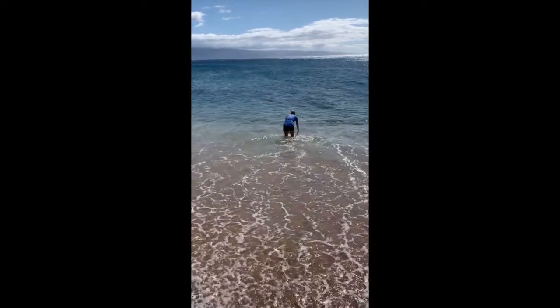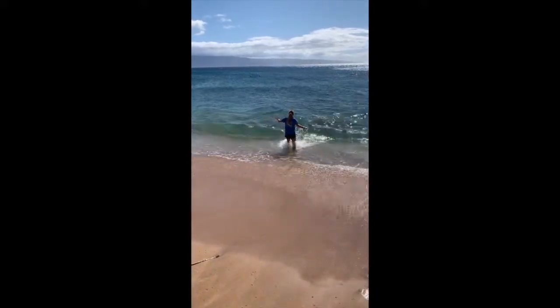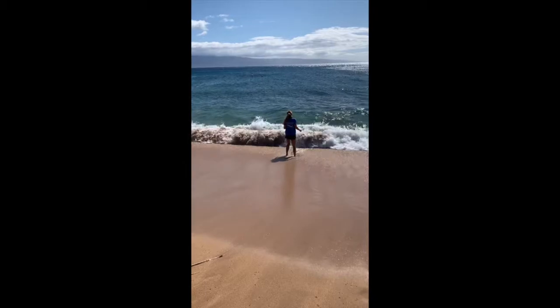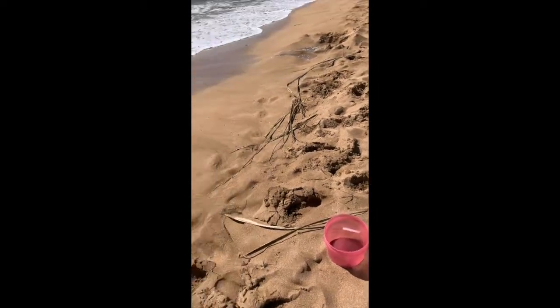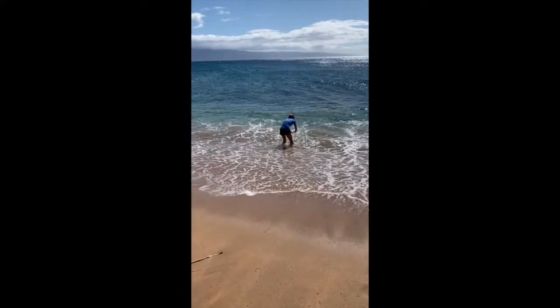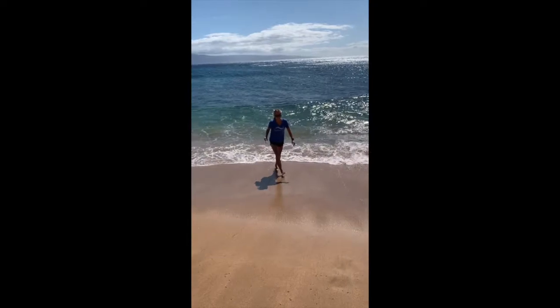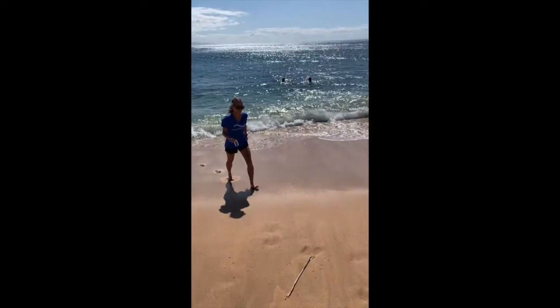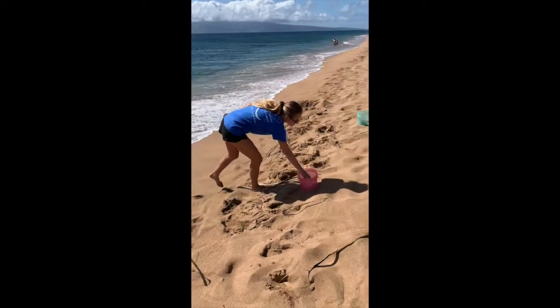Rinse the turbidity bottle and cap 3 times with ocean water. The 4th time, you will collect the water sample to be tested. Place the turbidity bottle about 1 foot under the water and collect the sample as a wave is moving towards you and the shore if possible. Then close the turbidity bottle with the cap and place it in the empty bucket.